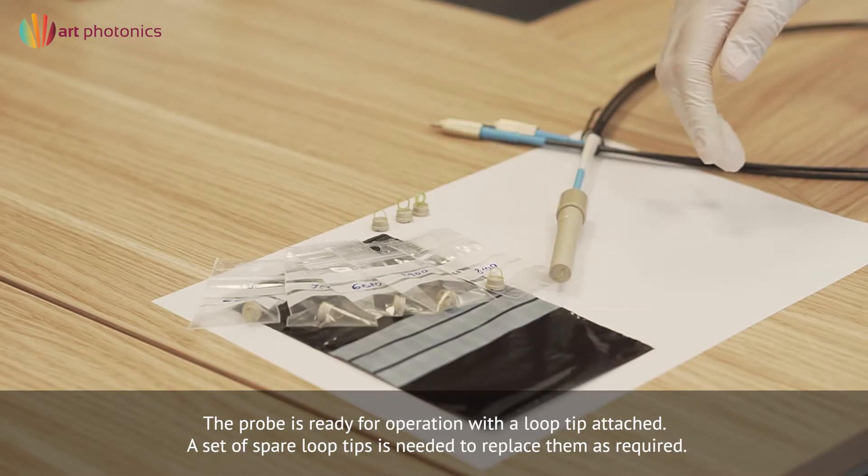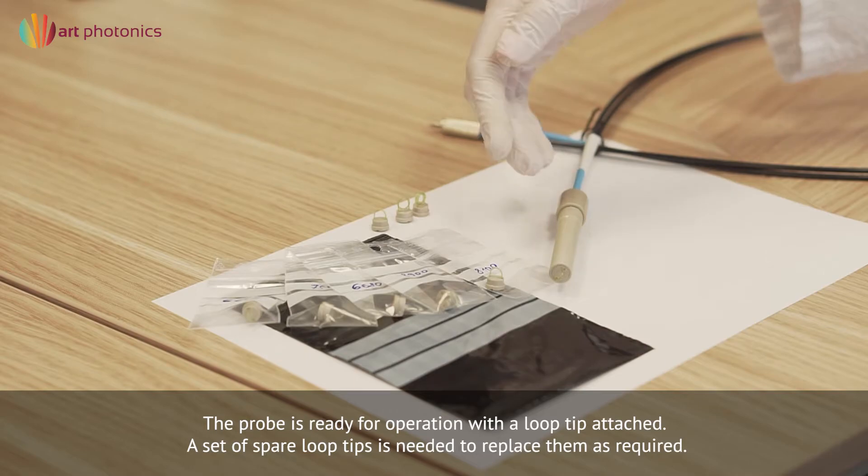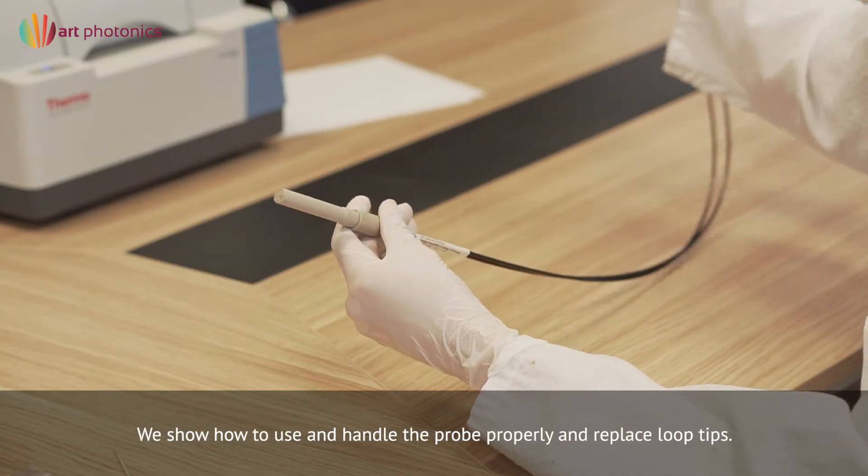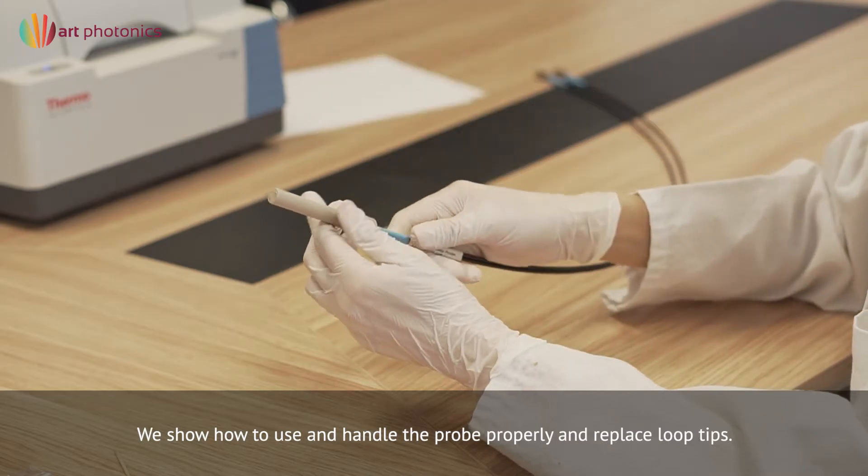To make your measurements, you need a set of spare loop tips to replace them as required. We demonstrate how to use and handle the probe properly and replace loop tips.